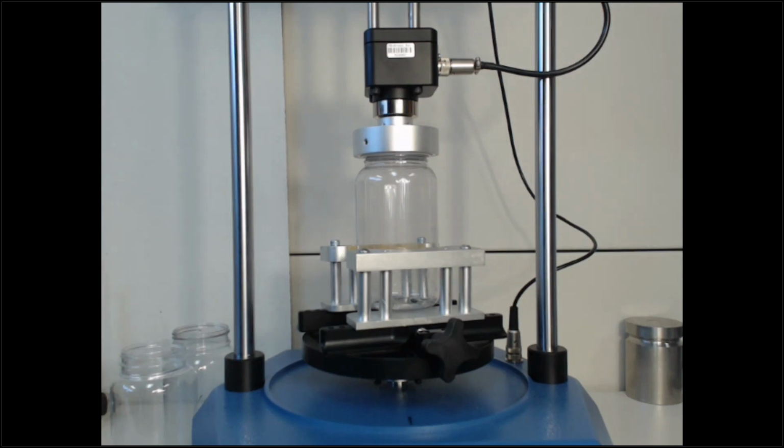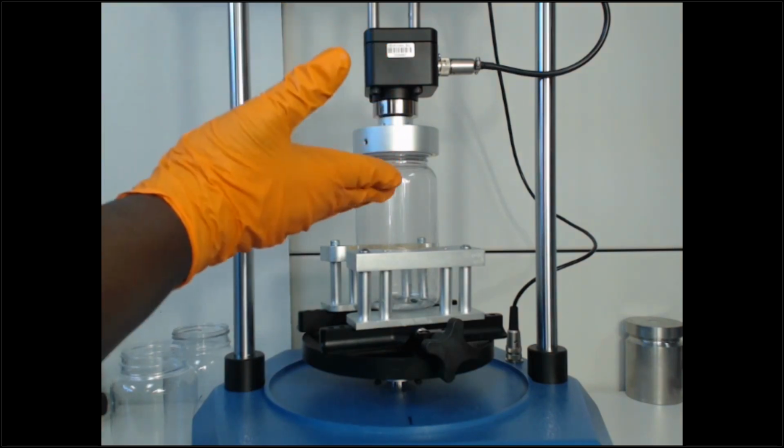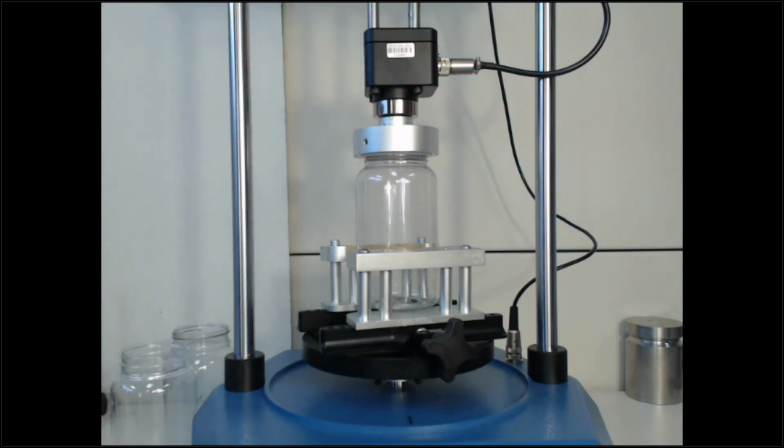So without further ado, I am going to run a test here, and let's see. All we're doing in this test is just running to 360 degrees. And if you look closely, as with most release torque applications, you should see that cap rise as the cap actually opens. So let's go.